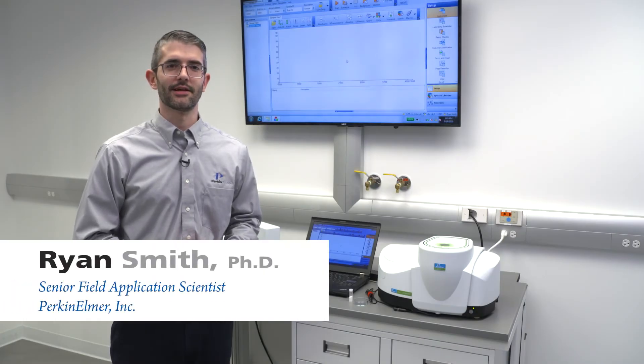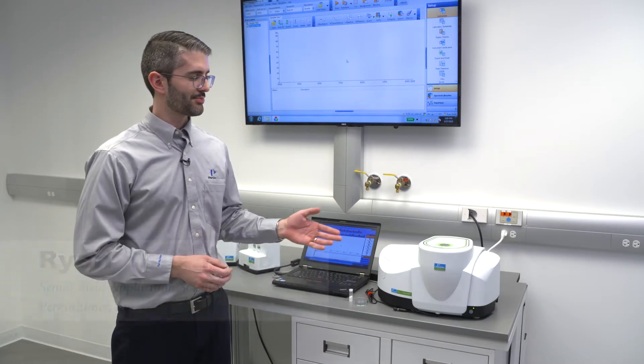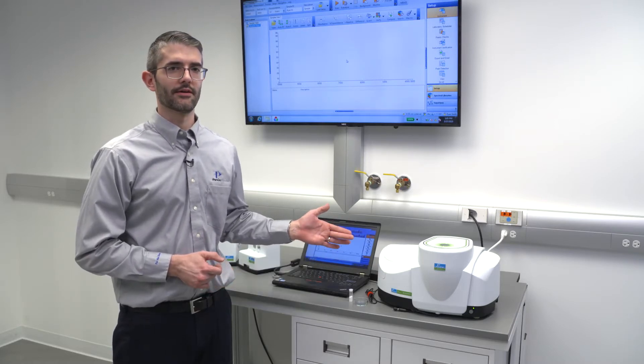Hi, my name is Ryan Smith and I'm an application scientist for Perkin Elmer. Here we have the Spectrum 2N FT-NIR instrument.